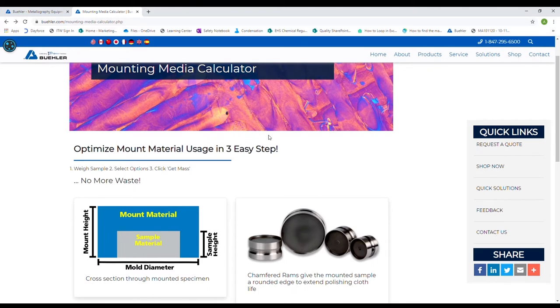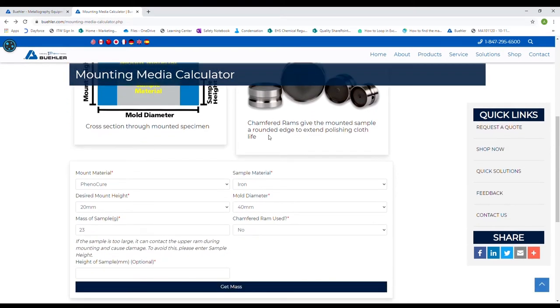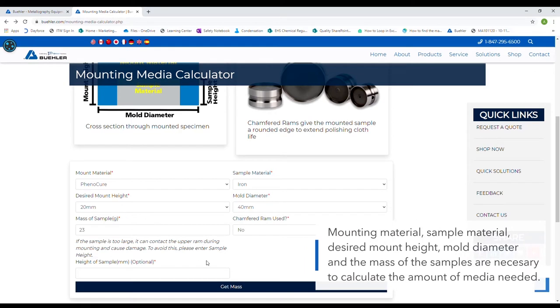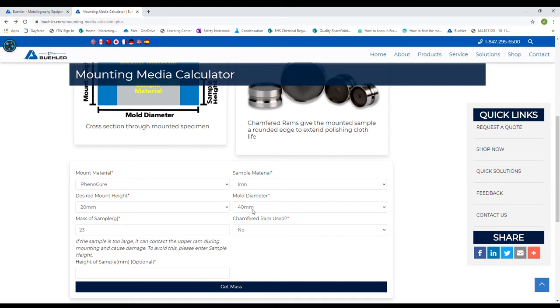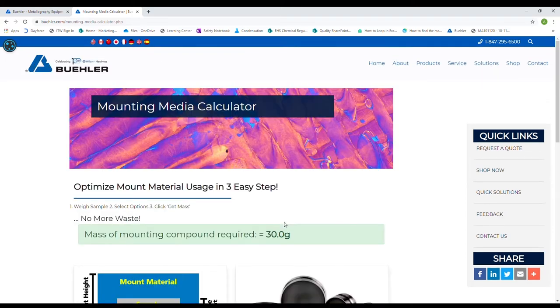Then it'll bring you to this page. Given the right variables, this page can calculate how much media you're going to need to get a specific height or amount. This is important because if you put too much media in the mounting chamber, it can mess up the SimpleMet 4000. For my specific parts, I need 30 grams of phenocure to mount the sample and get a 20 millimeter height. This is a really handy tool if you want to do a duplex mount.